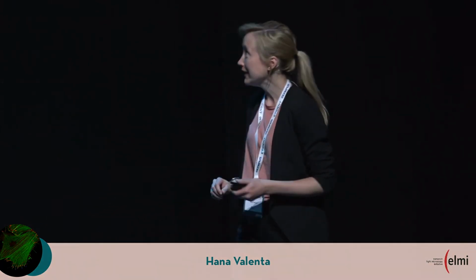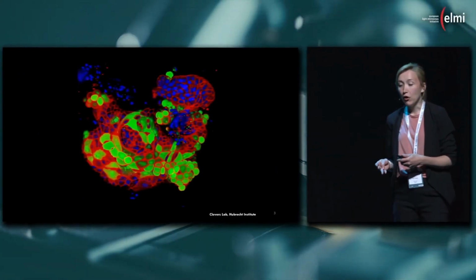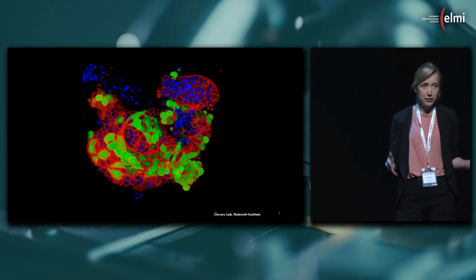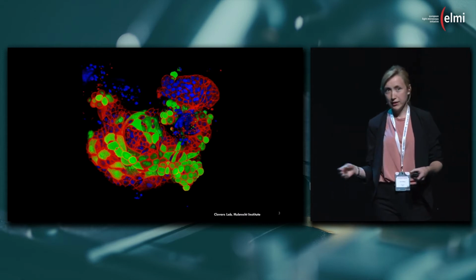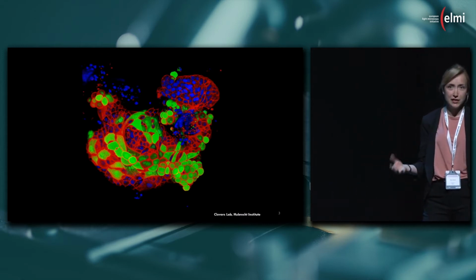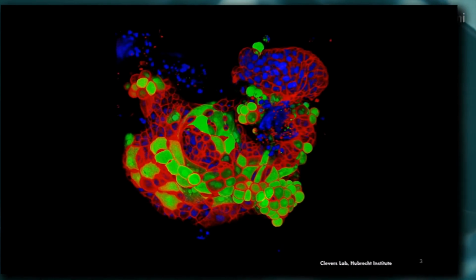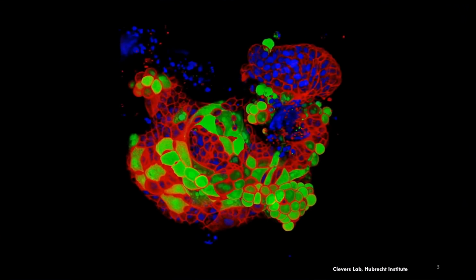So first question we can ask is, why would someone use spectrally overlapping fluorophores? Why would someone use the fluorophores of the same color? And the answer is multiplex imaging. Because if we can measure multiple components in the complex system, such as this organoid, but it can be even like single cell can be complex enough, it will help us to understand the complexity of the system, understand how this system works. But also, anyway, in this image, we still have only 3 colors. And why? Because fluorescence microscopy is a great tool, but you're still limited by the available spectral window.